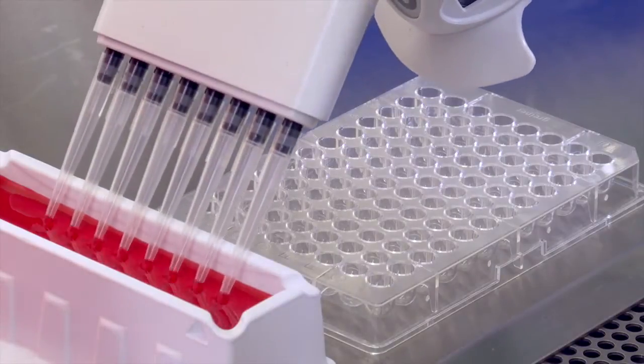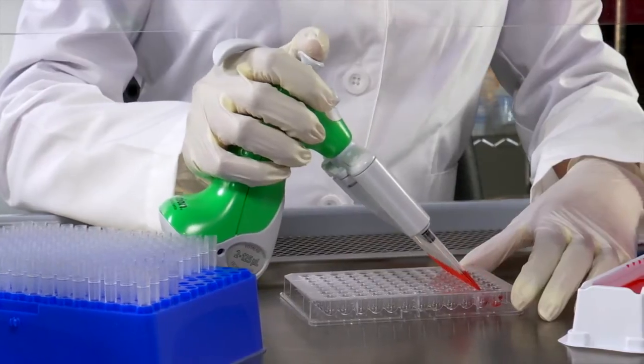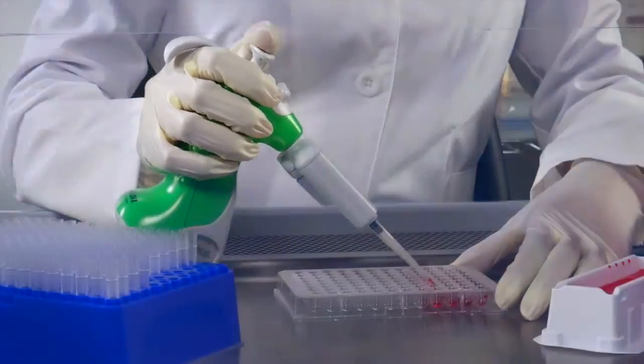Ovation's lightweight, ergonomic body provides ultimate comfort, especially with repetitive pipetting, and the adjustable hook allows you to guide the Ovation without the need for a tight grip.